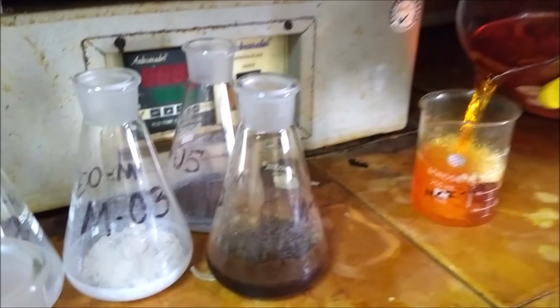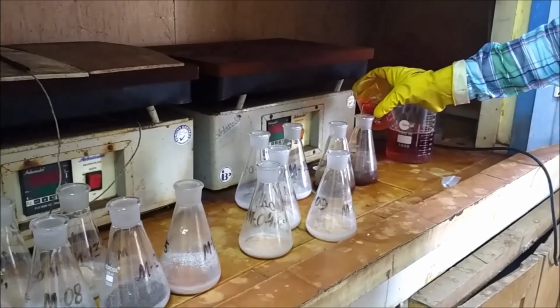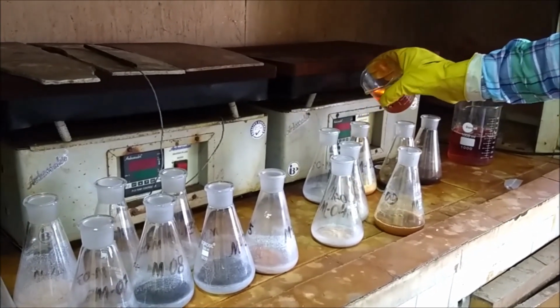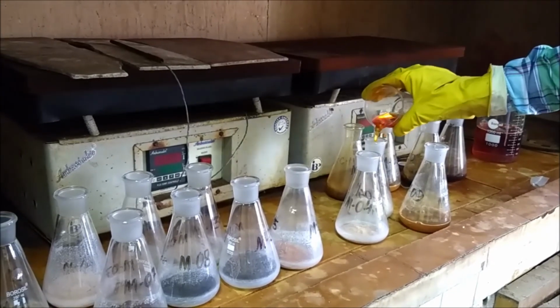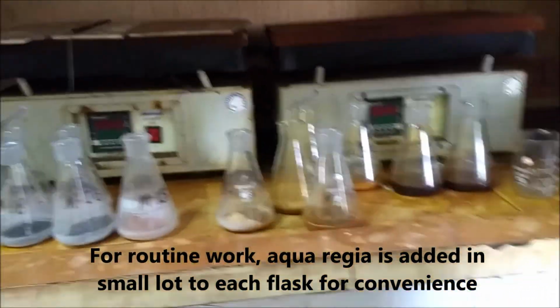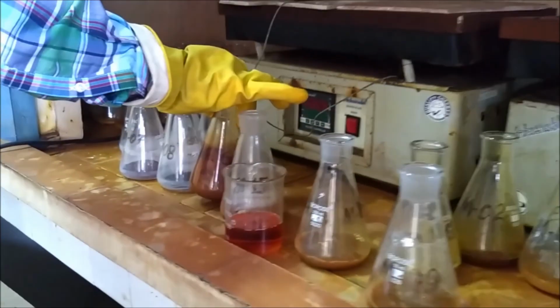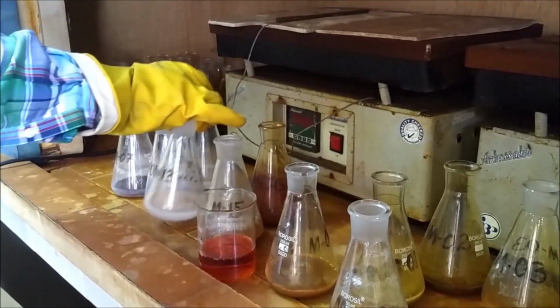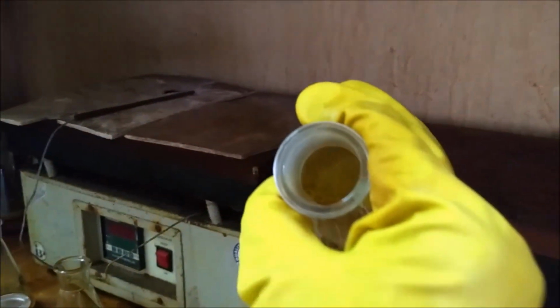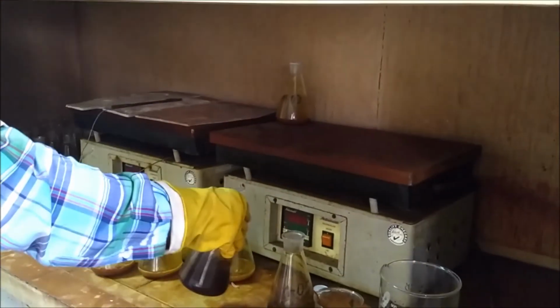For routine analysis, to maintain the activity of the aqua regia, we add this in small lots to each flask at the same time. As you can see, sometimes there is more effervescence because of carbonate samples. In those cases, one has to be very careful. So you have to have water very conveniently nearby to tame the reaction.